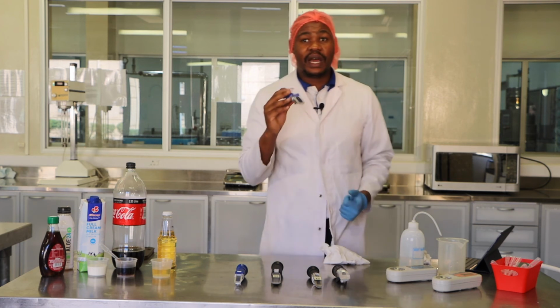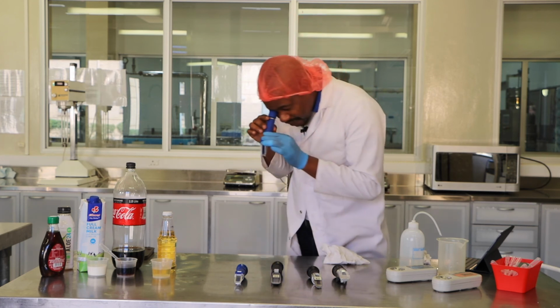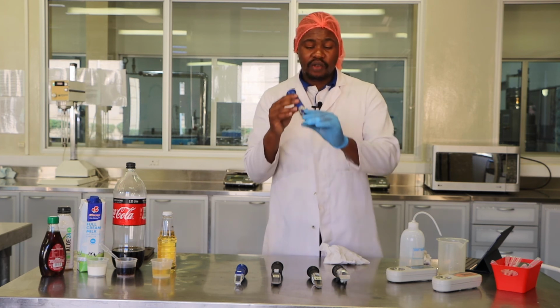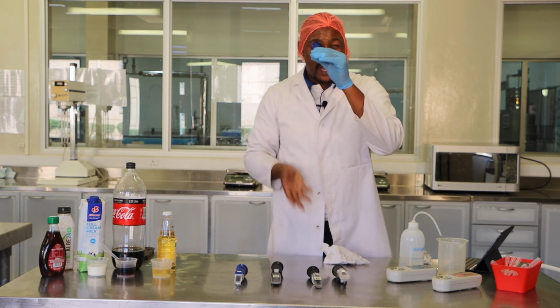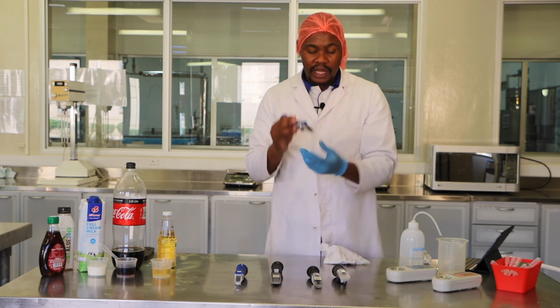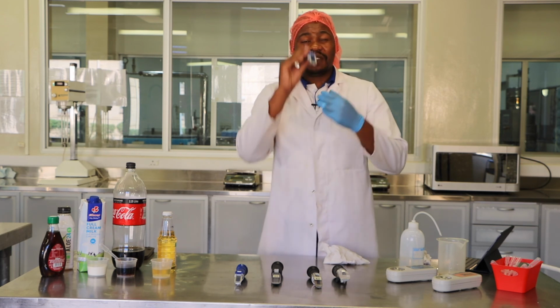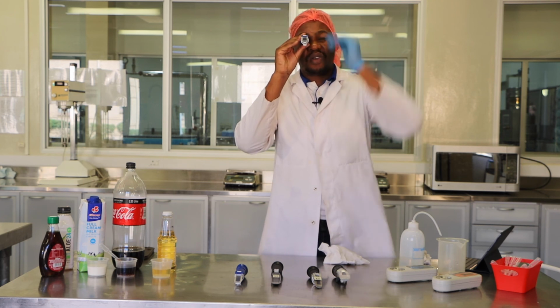During the practical, I always see people say to me, "Sir, I don't see it." Of course, if you're holding your refractometer like this, you're not going to allow the light to pass through the prism. The refractometer should always be held horizontally and do not block the light.